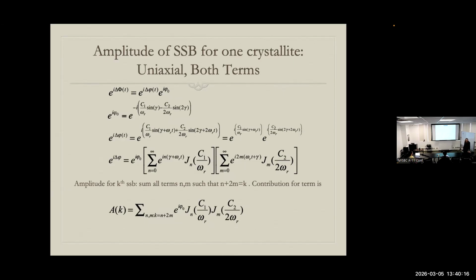You lose the power of solid state NMR if every time you think, what I really want to do is just forget about it and average. I think there's a tendency, even in the rare problems where you do that. You're calling it integration, but I think what you're really wanting is an averaging. And we do most of our measurements as an average. It's a true thing. But here are some of the insights you might lose.